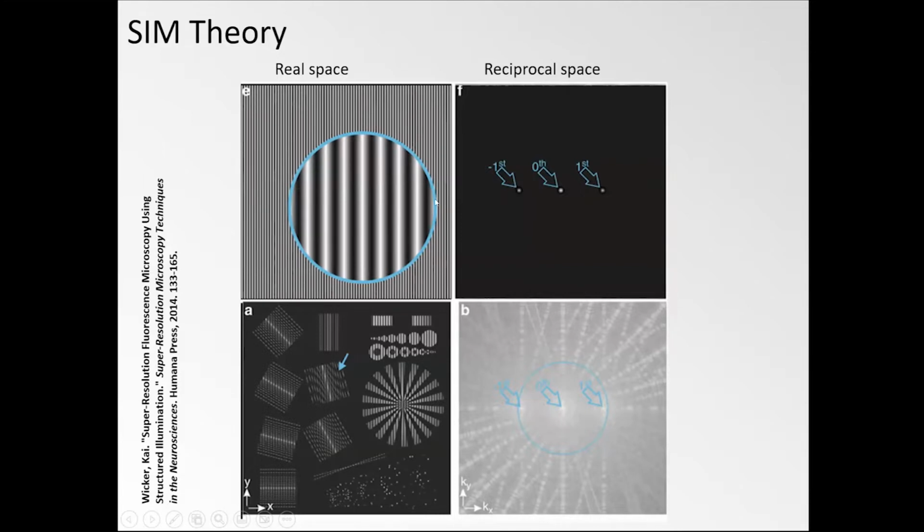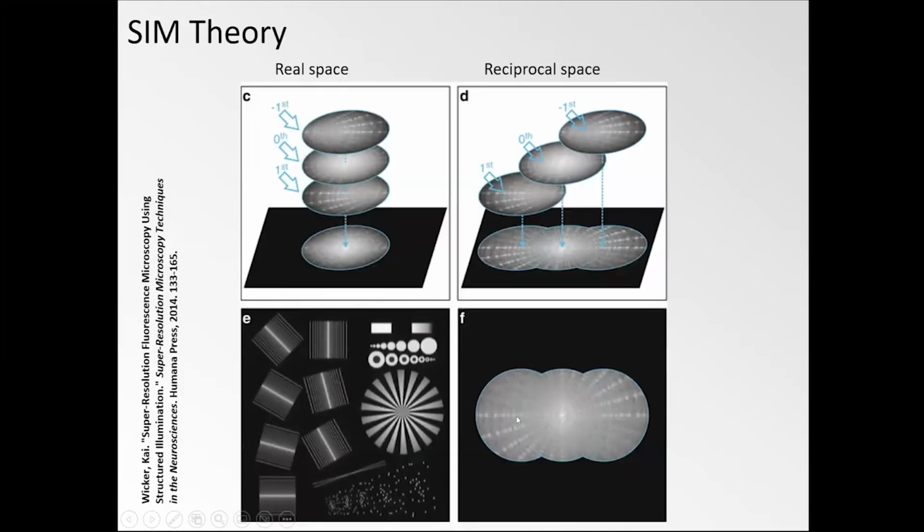However, that fringe pattern also obeys the diffraction limit. So usually these Fourier components or these frequencies also reside within the Abbe diffraction limit, or at best they can be at the border, and that causes essentially this doubling because the location from where they came sits here at the border, and then you add this additional information.